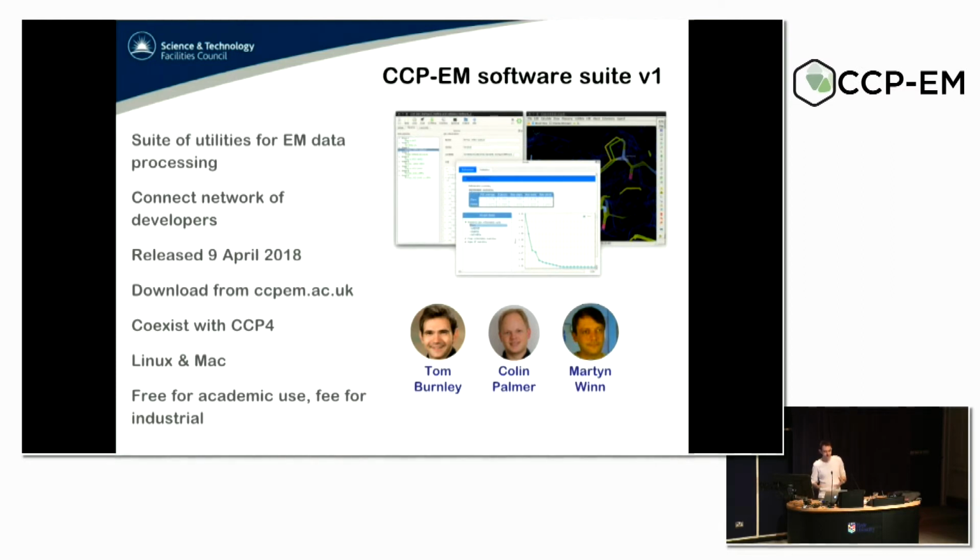And this contains a suite of utilities for EM data processing and allows us to connect together a network of developers across the UK and now into Europe that I'll go through in a bit.